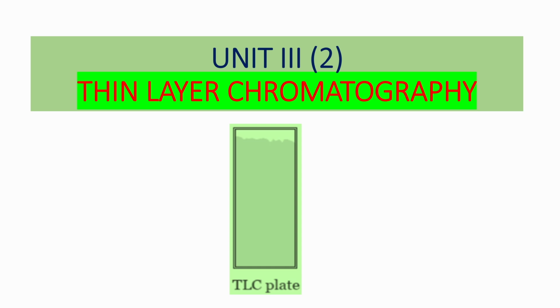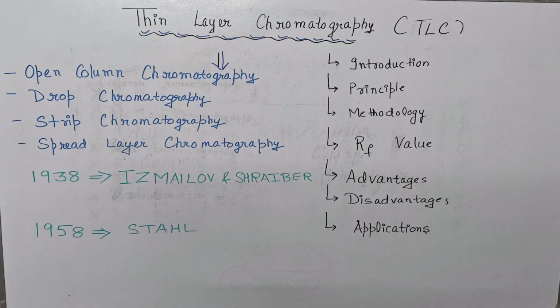Today we are going to study thin layer chromatography, commonly known as TLC. It is one of the simplest, fastest, and most widely used techniques for separating and analyzing mixtures. In this video, I will explain the introduction, principle, methodology, RF value, advantages, disadvantages, and applications of TLC.